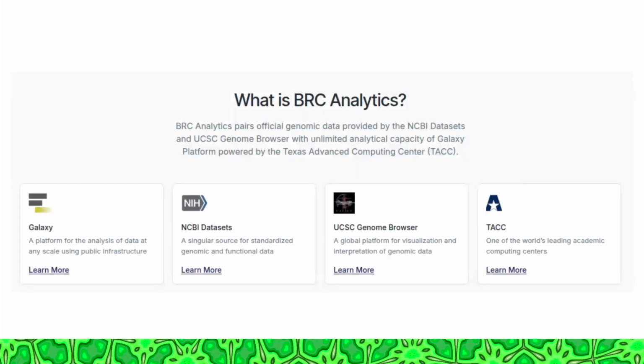So what is BRC Analytics? It's a consortium of these four main stakeholders. There's the Galaxy project. This provides analytical capability. You will see today that this is a platform which allows you to run tools, combine them into workflows, so do essentially any kind of analysis you can imagine with any open source tools that exist for genomic and general data science. We're not limited to genomics, really.